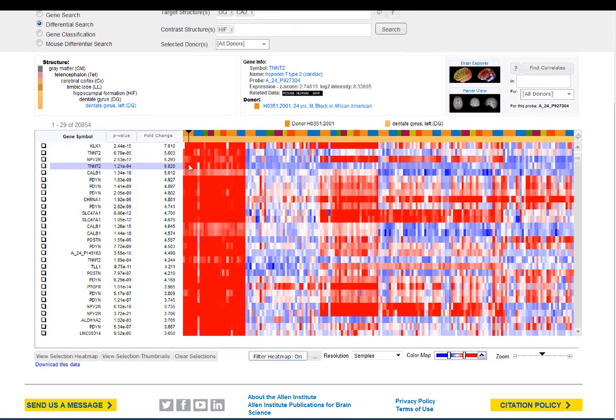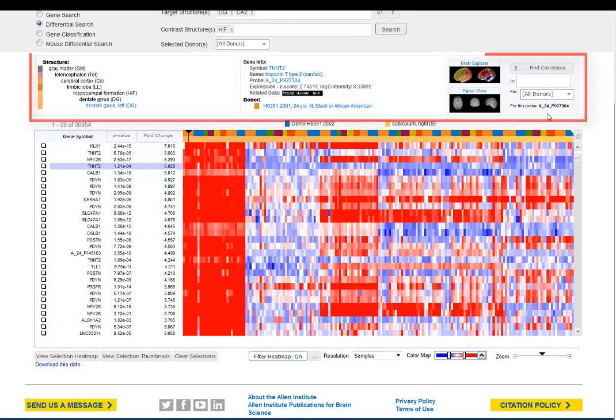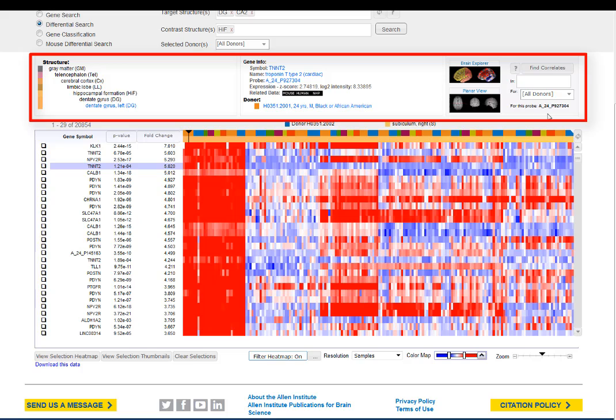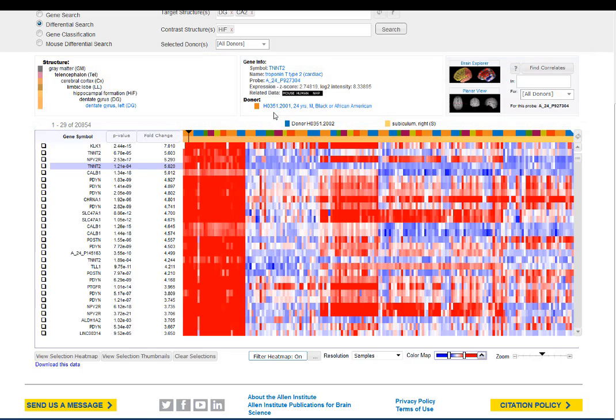If you click on the heat map itself, you'll bring up metadata for the sample you clicked on, including structural information, gene expression values, as well as links to different ways to see the data, including whole brain representations of the gene expression pattern.